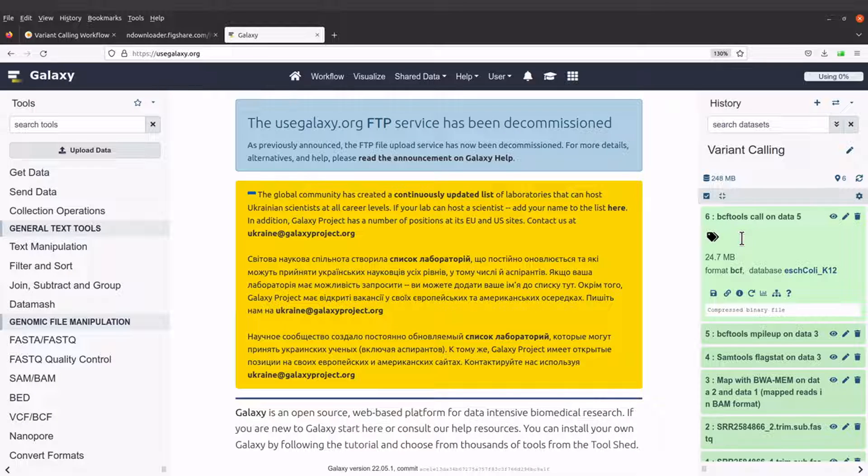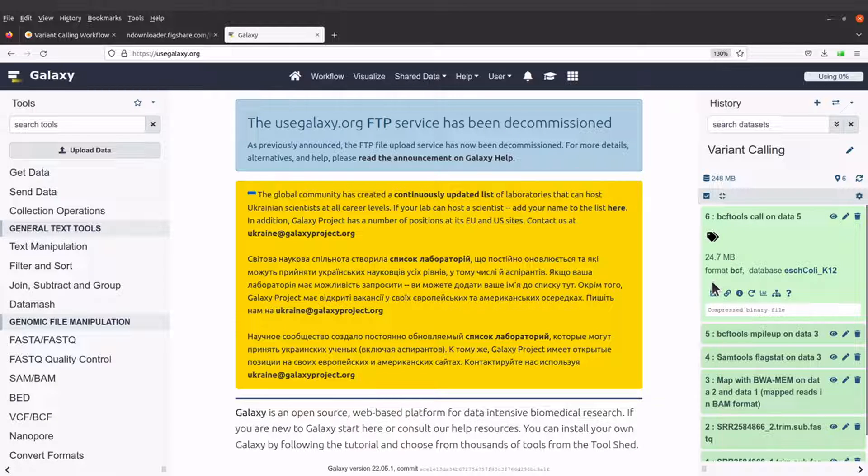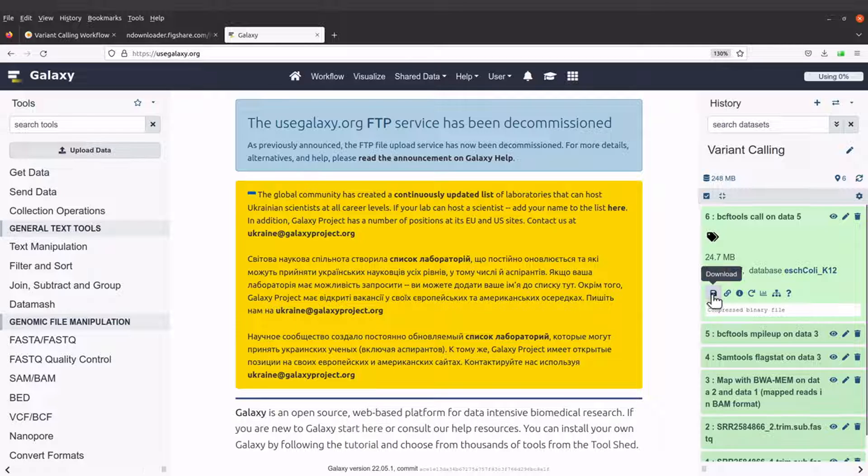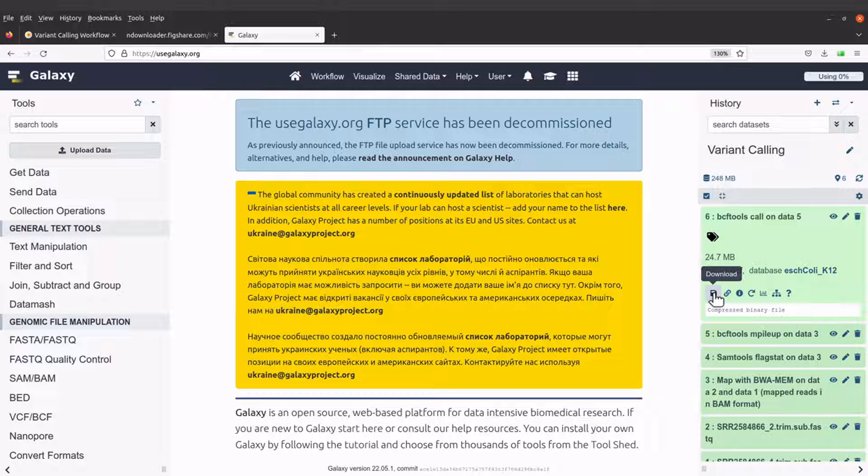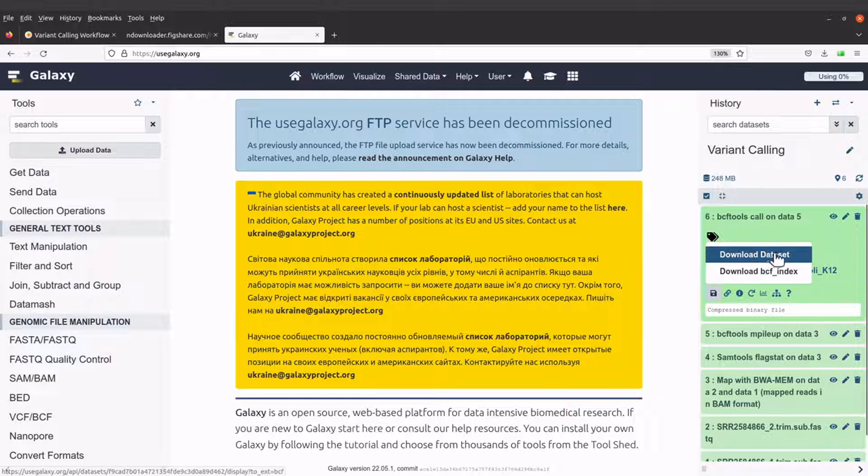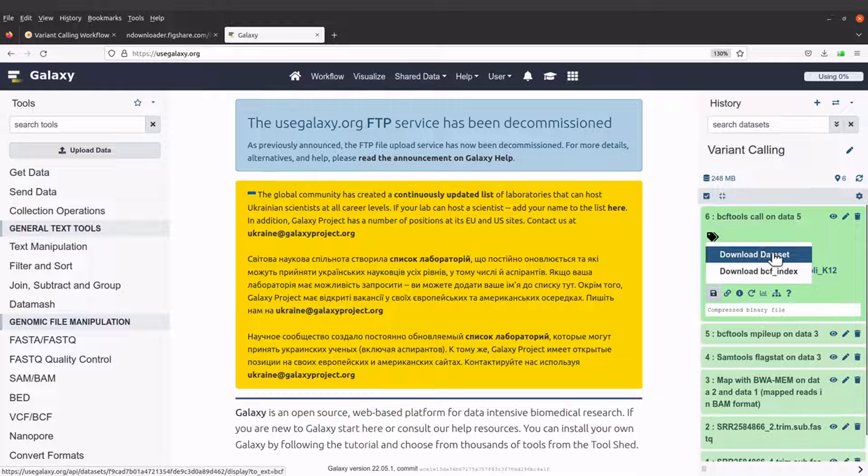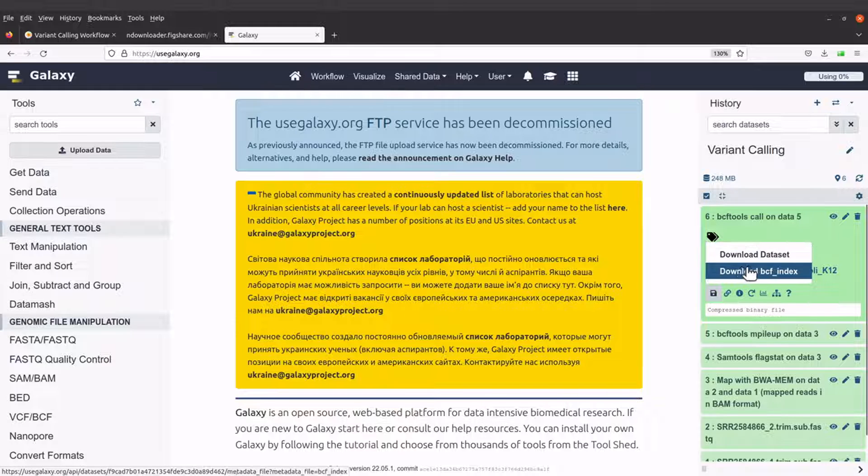What we are going to do next is to download the output file. So let's go to the download button here. You just hover your mouse and you see this text download. So click it and you will have two options. Either you will download the dataset or you download the BCF index. You will download both. The dataset contains the variant information and the BCF index is the index file.